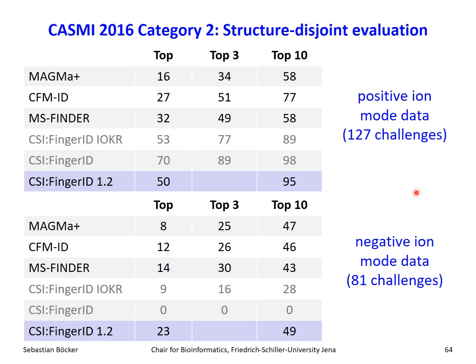Anyways, I took out these two and I replaced them now by the newer version of CSI FingerID, which was published in 2019 with the SIRIUS paper. And what you see is you have really a drop in top identification. So correct identification in the top position. I don't know this number, it wasn't in the paper, so I thought I leave that out. It's not that important.